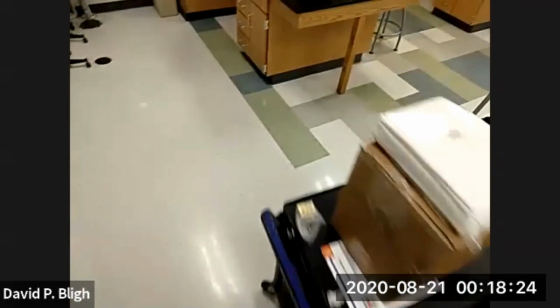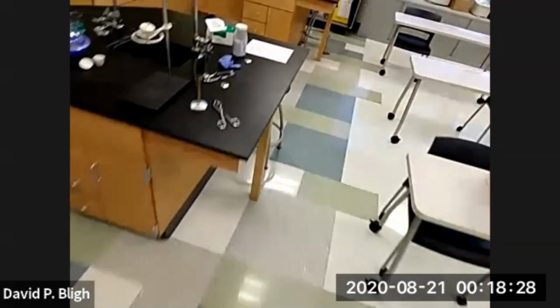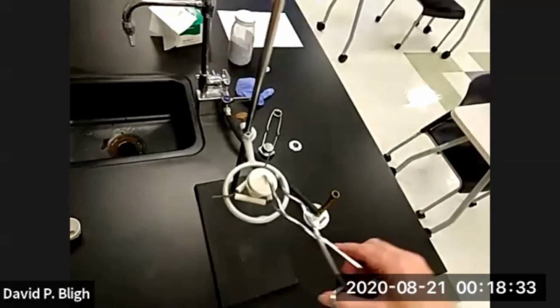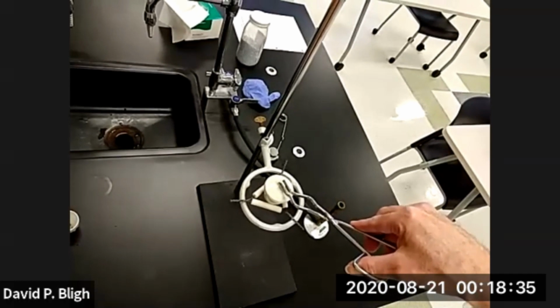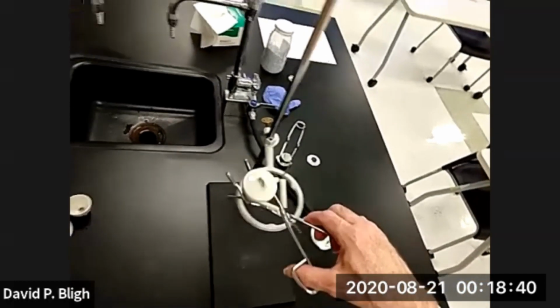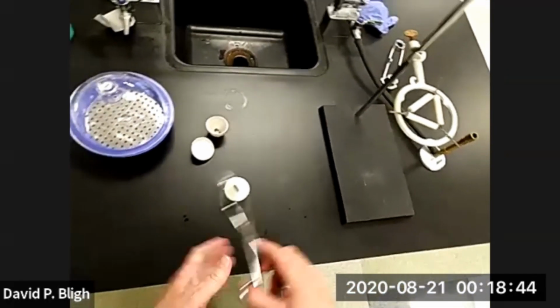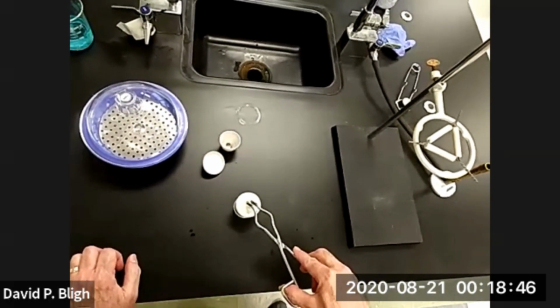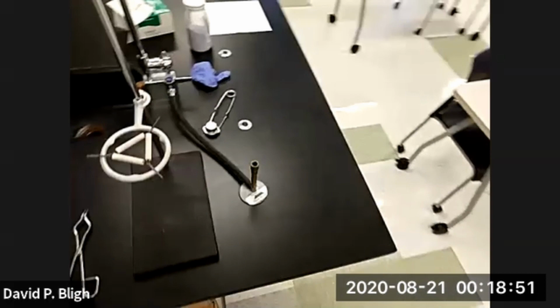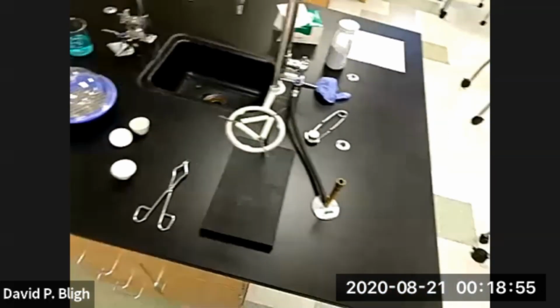Okay. Let's move this over away from the heat. That's not the only thing that's hot here. Cool this down a little bit. Set the lid off. A bit like that. Okay. So now we want to let those things cool, obviously.